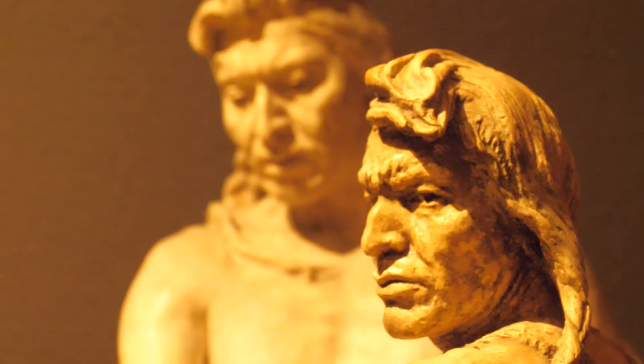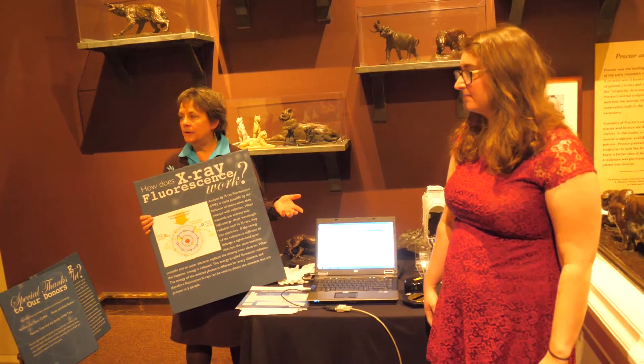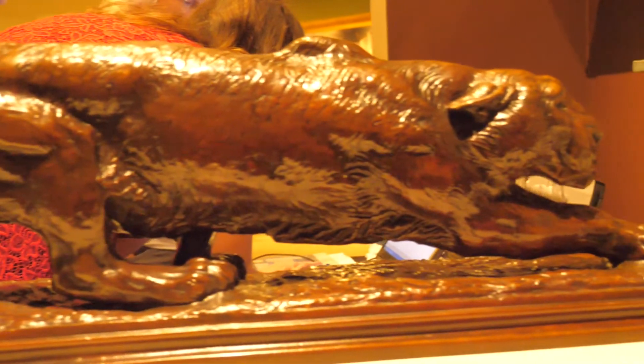Today we're talking about XRF — X-ray fluorescence — and how we've used it in a Proctor bronze project. Over the past couple of years, we've tested over 140 Proctor bronzes.